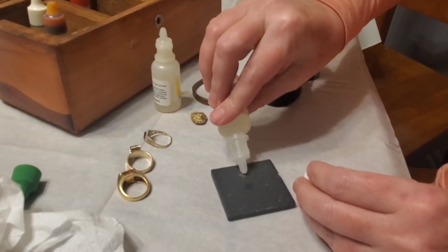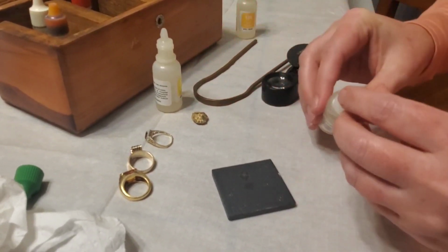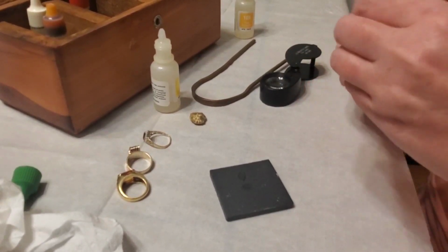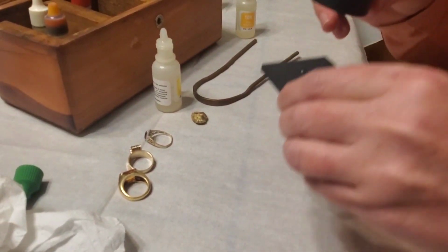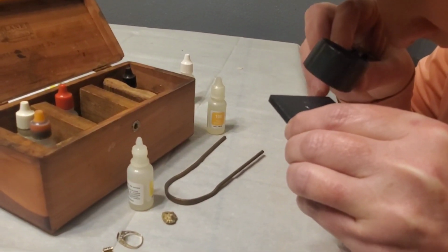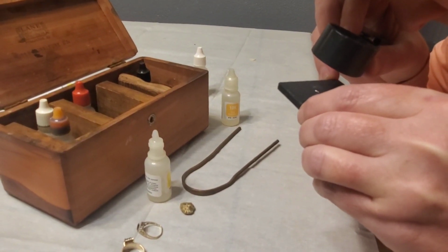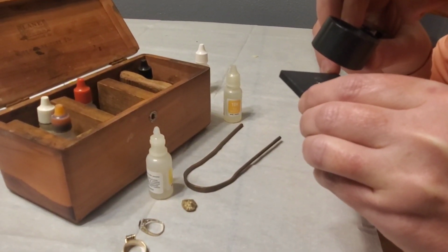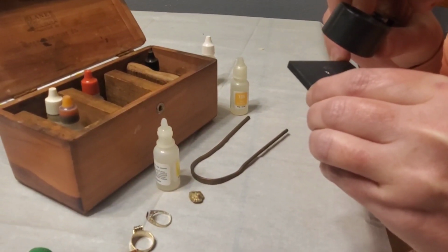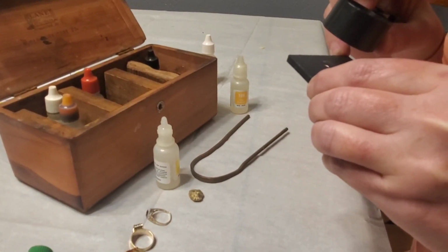I'm really curious because whatever it is, okay, that looks like it's gone. Pretty much, but I'm going to look at it with a loupe and see. Yeah, there's still gold, but it's floating. I've never seen this do this before. It's really weird. Yeah, it's almost all gone. But there is some floating in that. Huh.